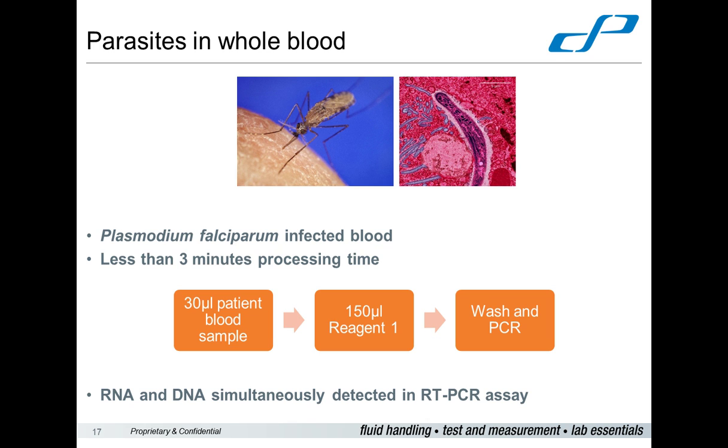This was an assay that we actually developed in-house to prove a concept. So this was not a commercial Plasmodium assay. This was an in-house laboratory developed test in our clinical laboratory. And we were simultaneously detecting RNA and DNA from the Plasmodium.